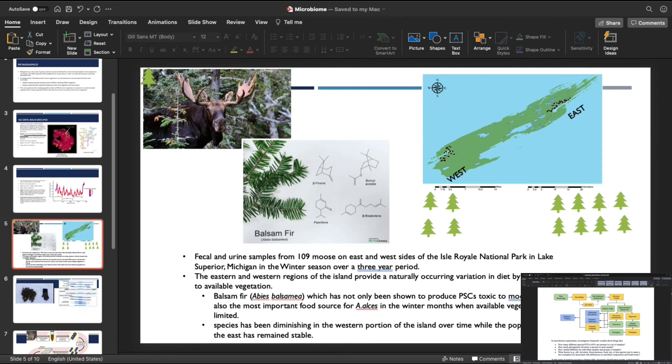And then you do what's called demultiplexing, and you join those sequences because they read them reverse and forward. Then you match those sequences to their sample, and then you create what's called a feature table or an OTU table, or now an ASV, amplicon sequence variant, where it's a table of how many different species are present in a set of samples.